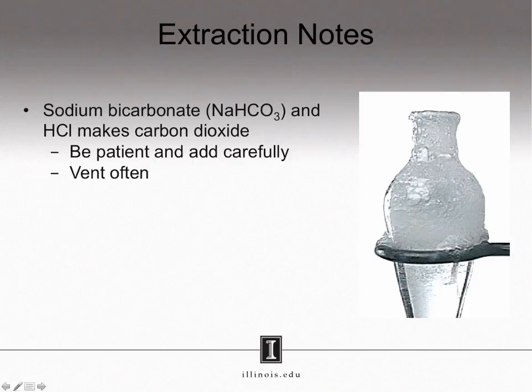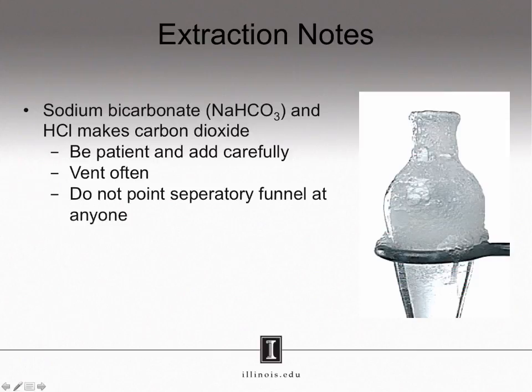When shaking your separatory funnel, you will be making carbon dioxide, which will build up pressure in your separatory funnel. As a result, make sure you vent often to prevent dangerous buildup of pressure. Along those lines, when venting, or even just when shaking, do not point the separatory funnel at anyone, so that any gas that is released does not impact your fellow students.